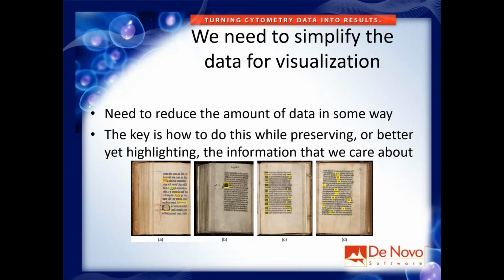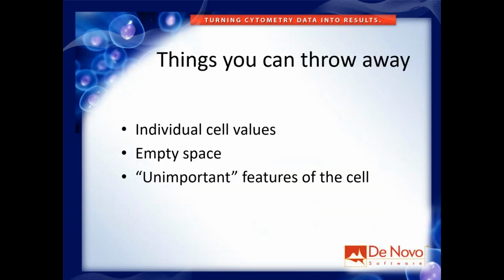The concept is that not all the information present in the data is important for us at this moment. So let's throw away some information, and if we can do it in a smart way, the remaining information might be enriched for what we are actually interested in. Okay, and that's what we want to do.